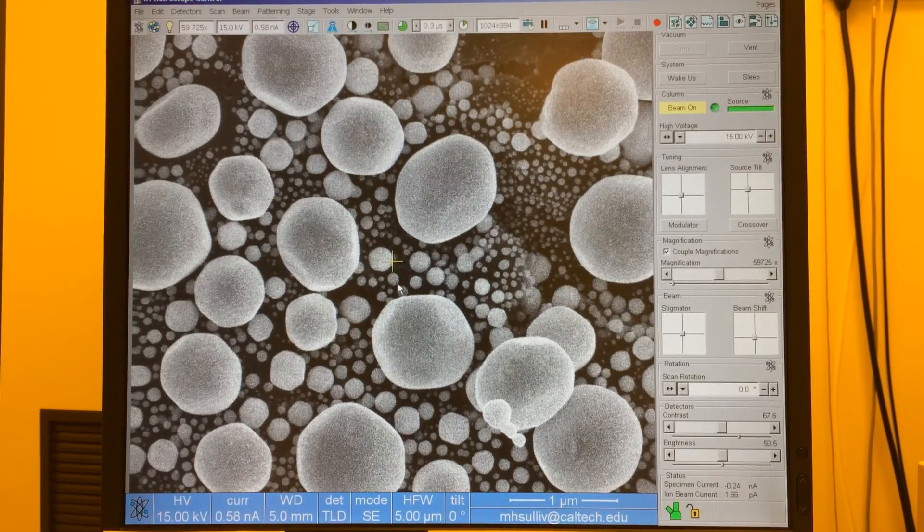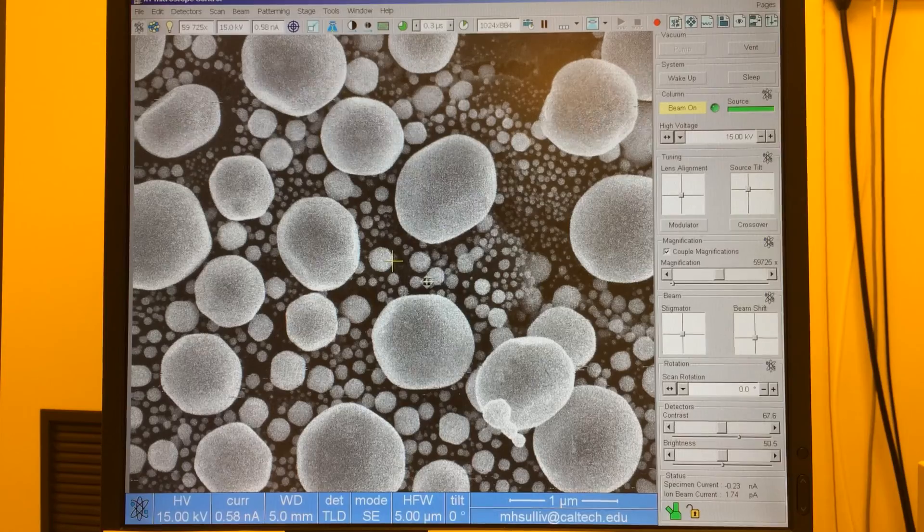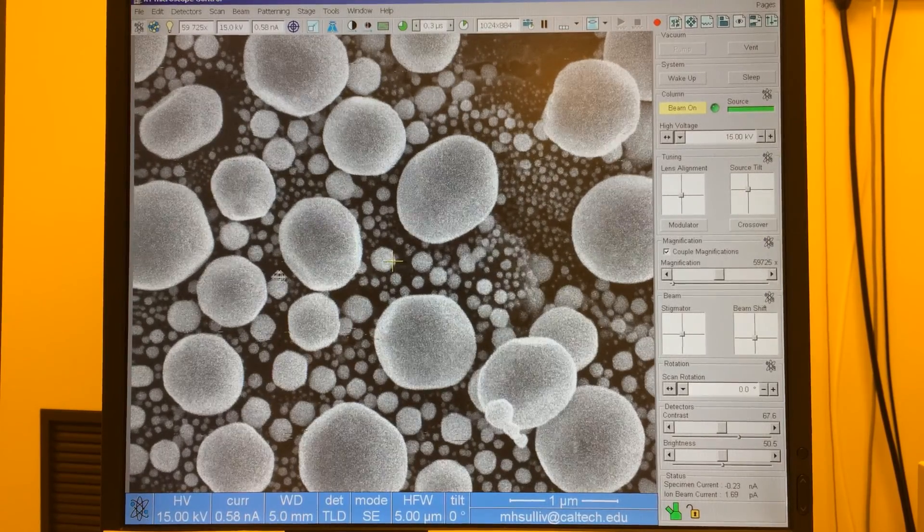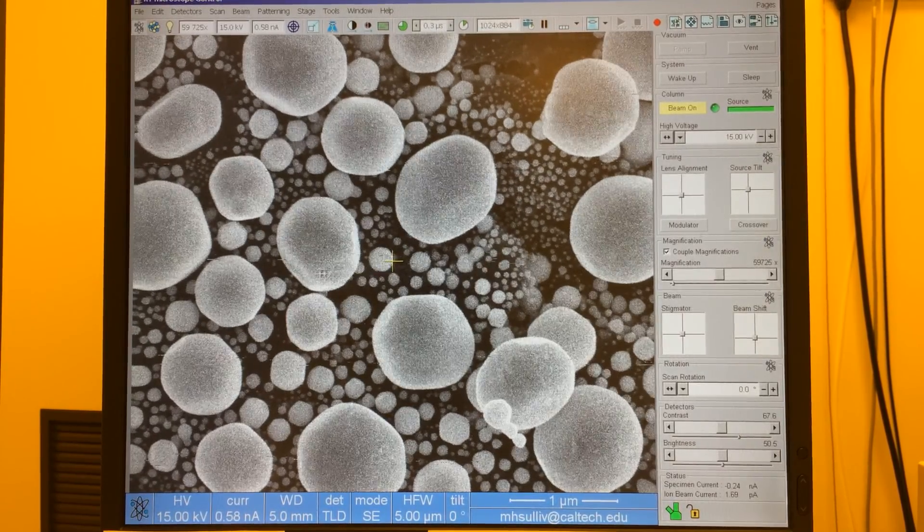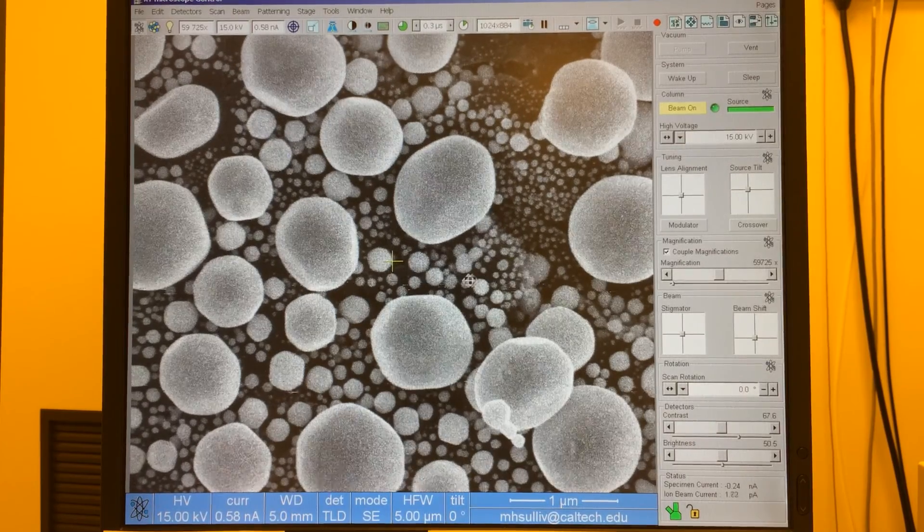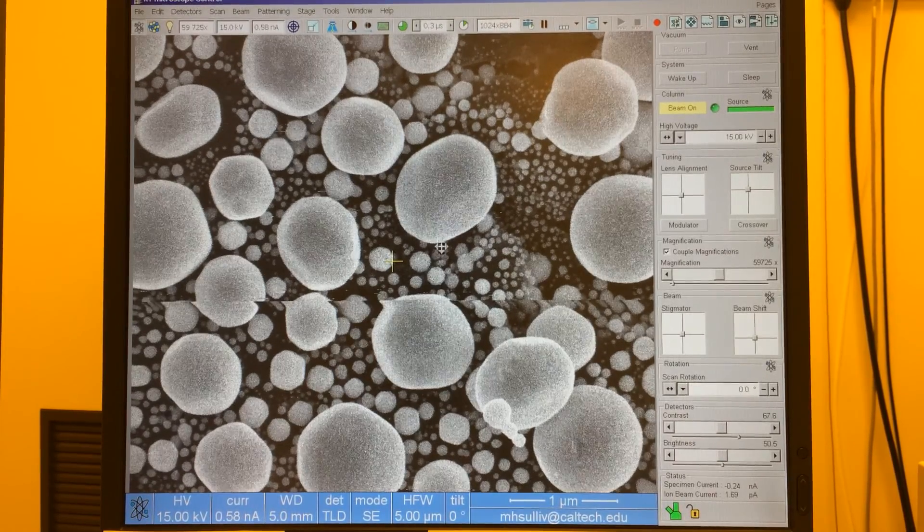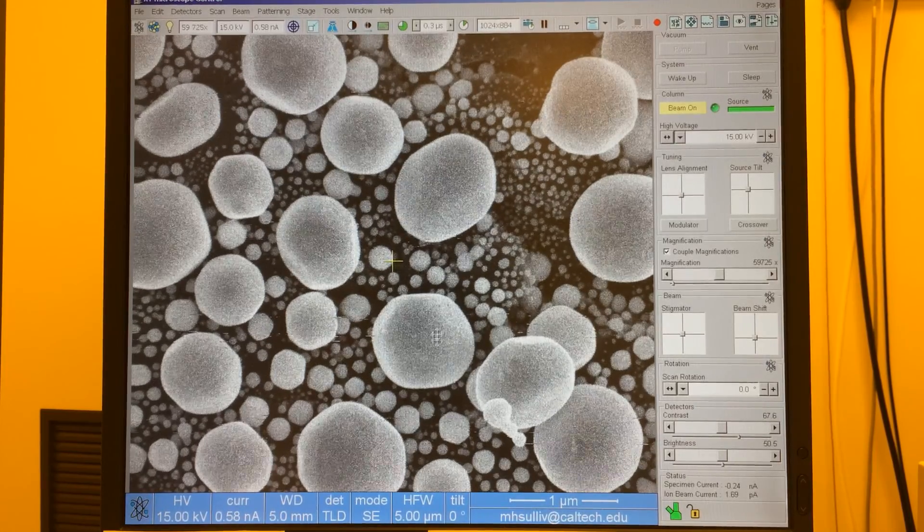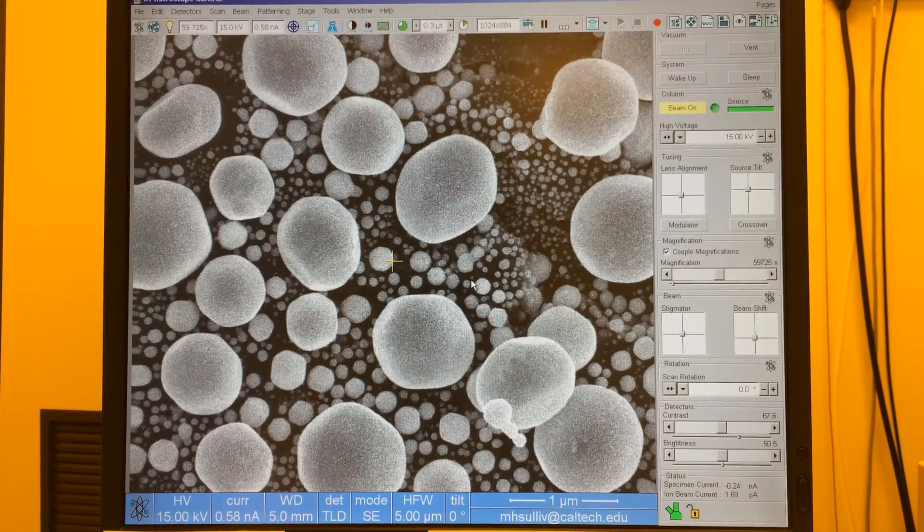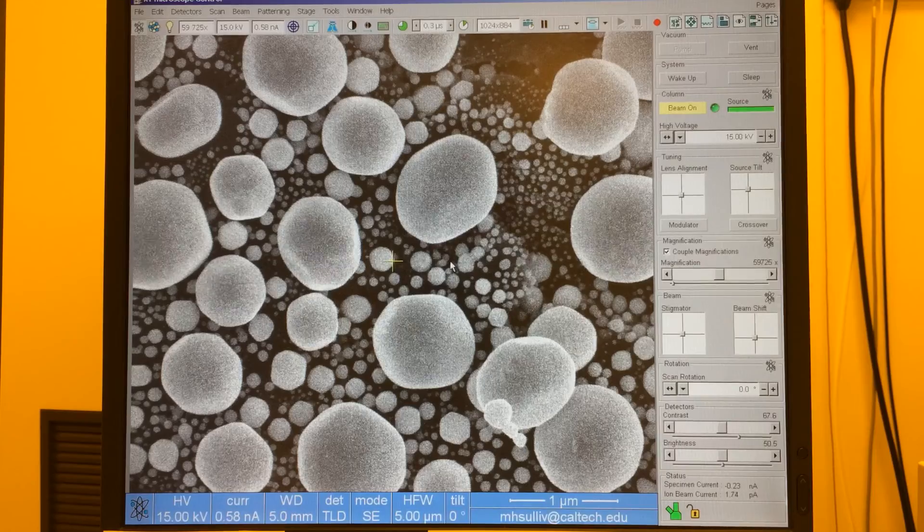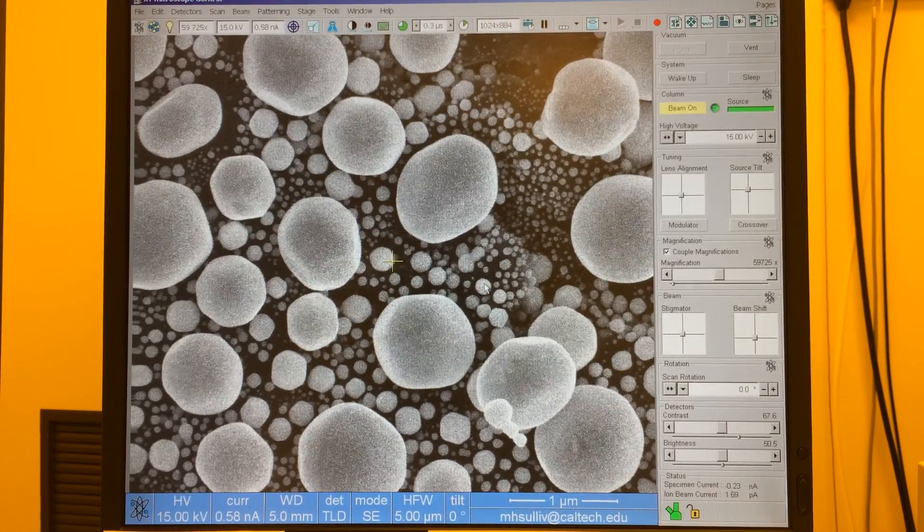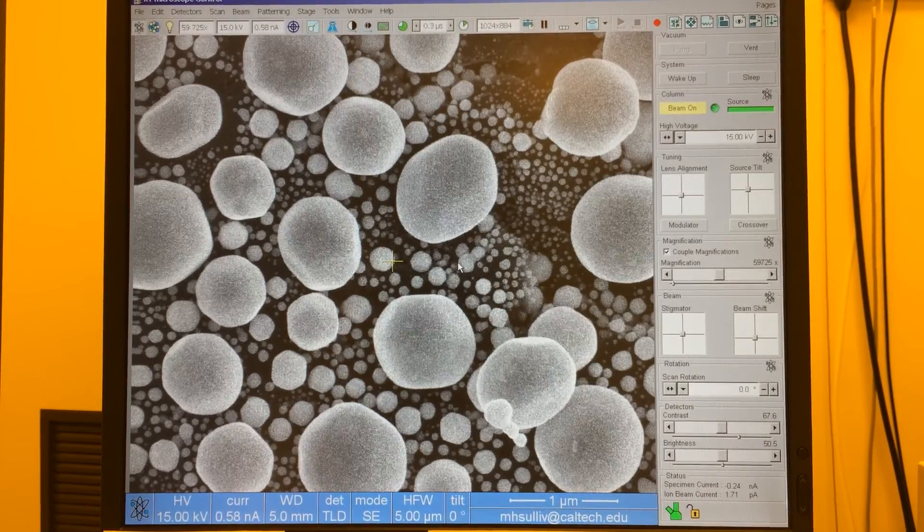But one thing I want to show you is that while I was fixing that x and y astigmatism, you can see the image is shifting right now left and right as I move x astigmatism. When I go up and down it's also shifting maybe a little bit on a diagonal. So if we see shifting while we're fixing astigmatism, that's our visual cue that we need to fix the stigmator alignment.